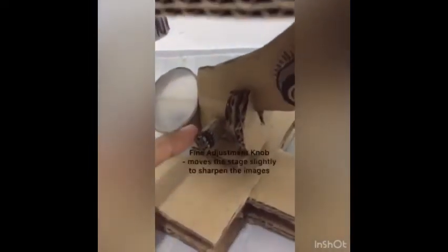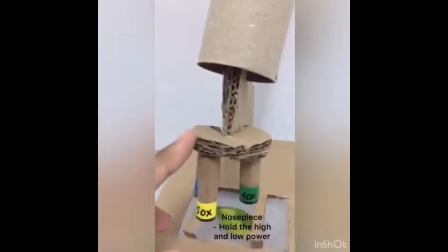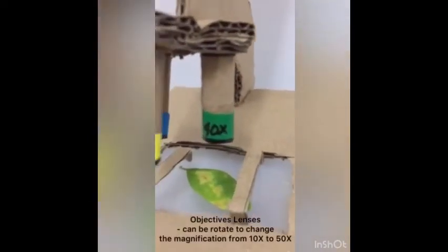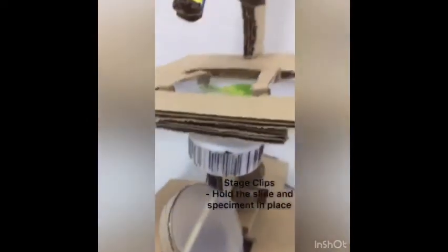And then we have the fine adjustment knob, which moves the stage slightly to sharpen the image. Next, we have the nose piece, which holds the high and low power objective lenses, which can be rotated to change the magnification, and the magnification ranges from 10 to 50. And then we have the stage clip, which holds the slide and the specimen in place.